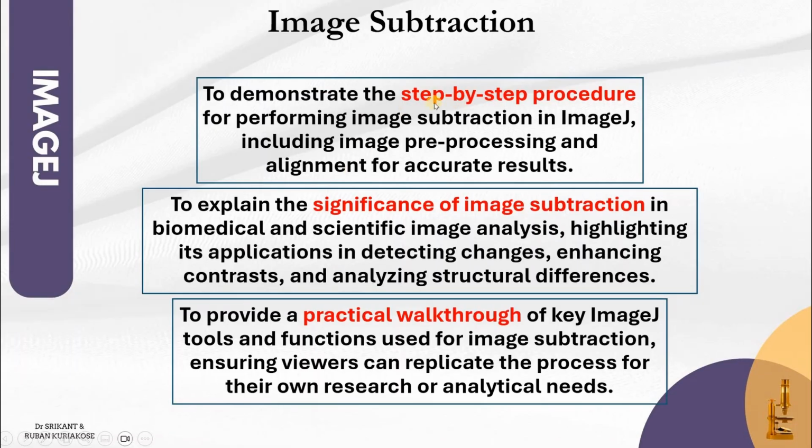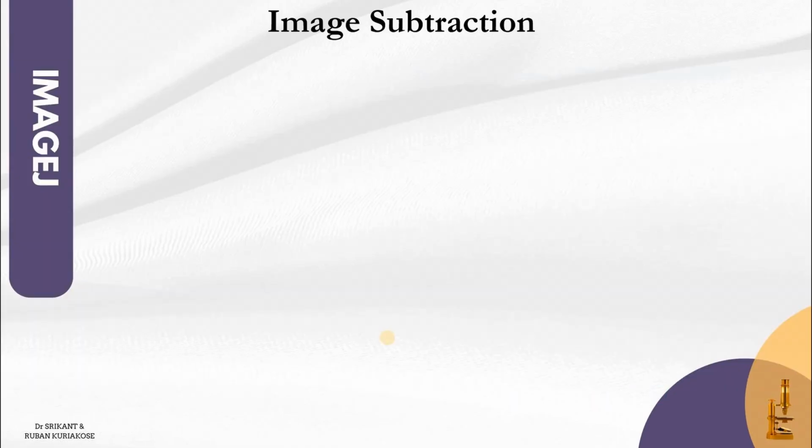We have shown you the step-by-step procedure. I've given you some examples of clinical significance, and I have shown you the practical walkthrough, including the plugins that you may require. Feel free to answer the MCQs that follow.